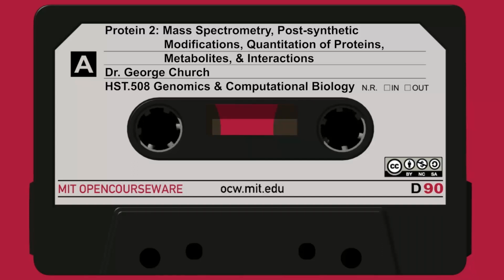Now, when people assess casually whether a particular method is quantitative or not, they can be easily intimidated. So they might say, I've commented that the ionization of, so the ESI stands for electrospray ionization, mass spectrometry.